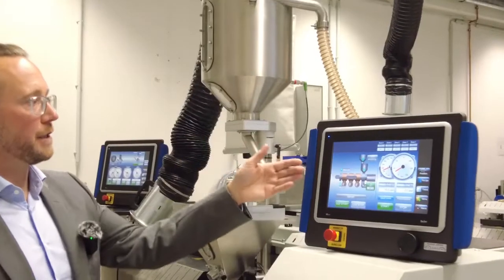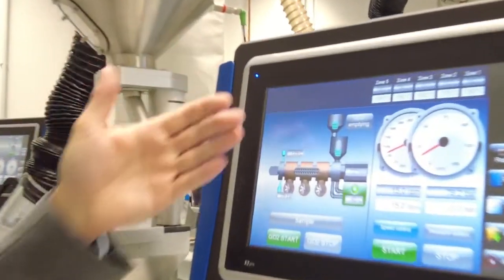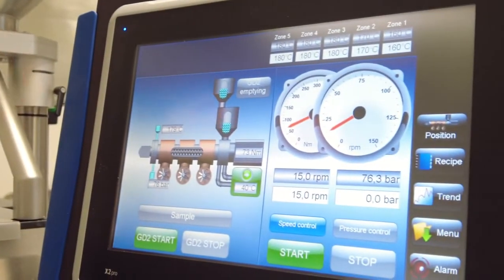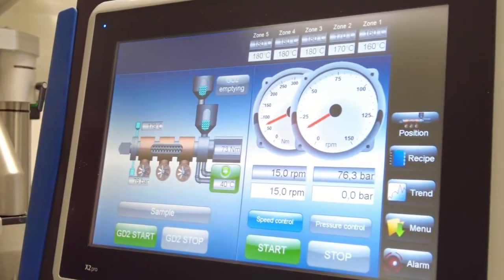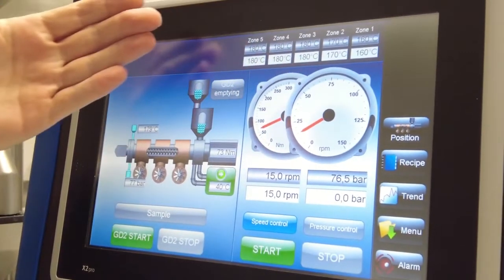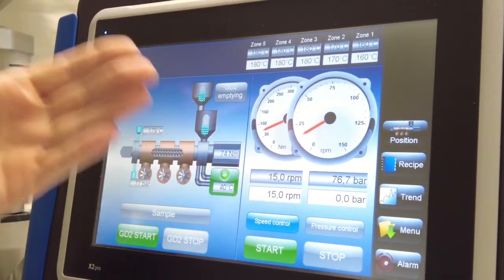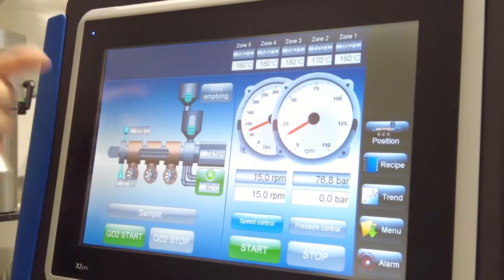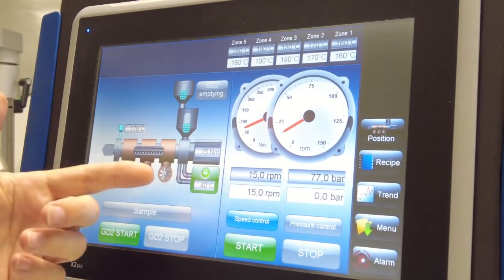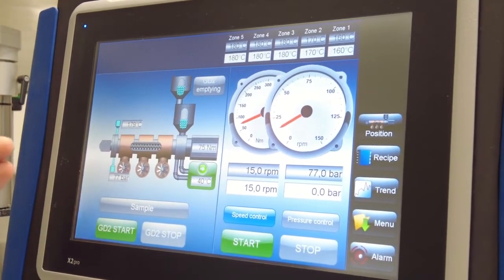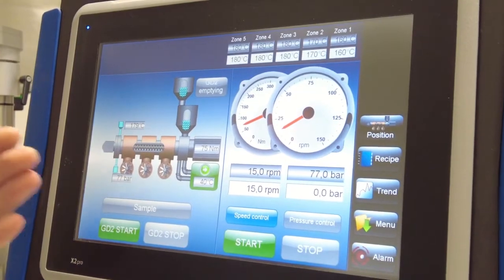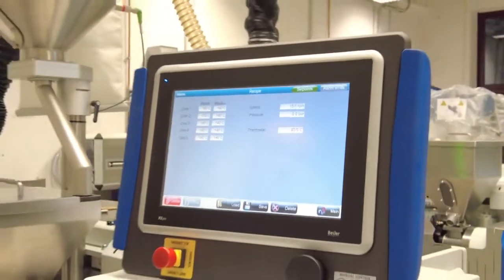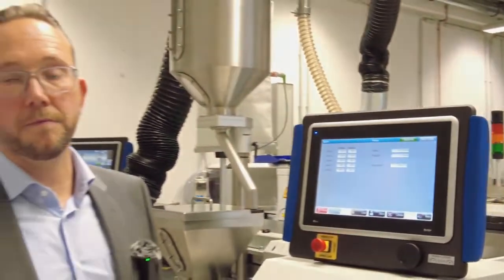On the main screen of the extruder we see all parameters that are very important for extrusion. We have the temperatures, the actual screw speed, the actual pressure, the melt temperature, the torque, and the whole system will allow you to store recipes for each material.